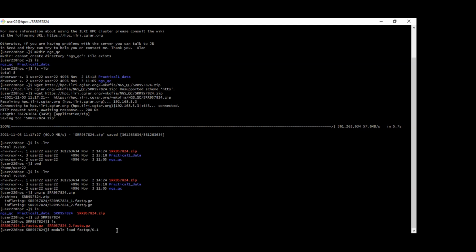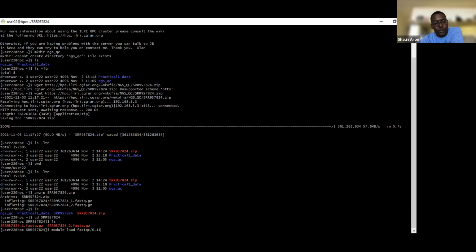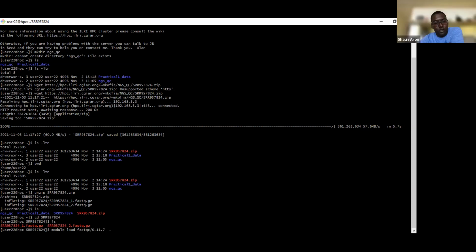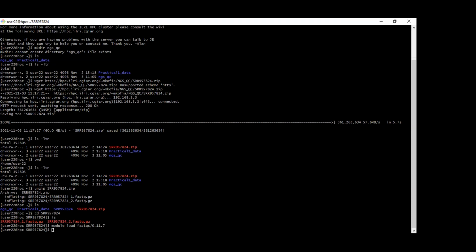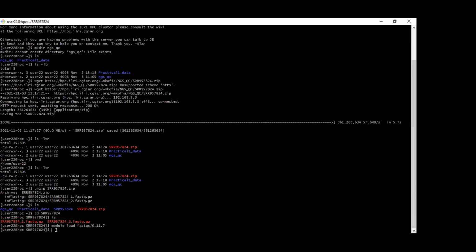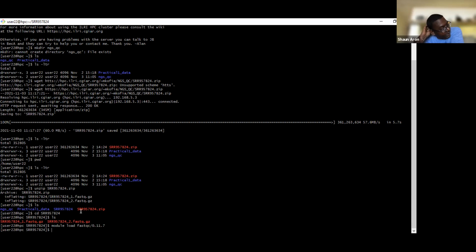Yeah, then it's one again. Another one. Yeah. Dot 7. Enter. Okay, and now you can continue from the practical manual, from the fastqc step. Thank you so much, sir.